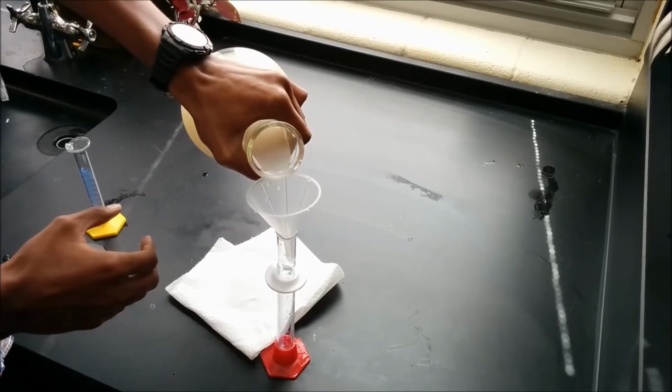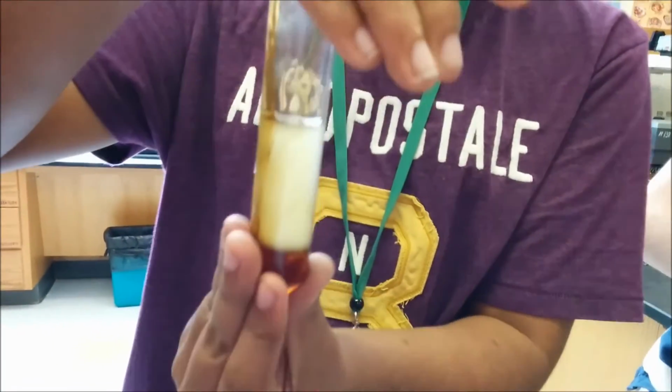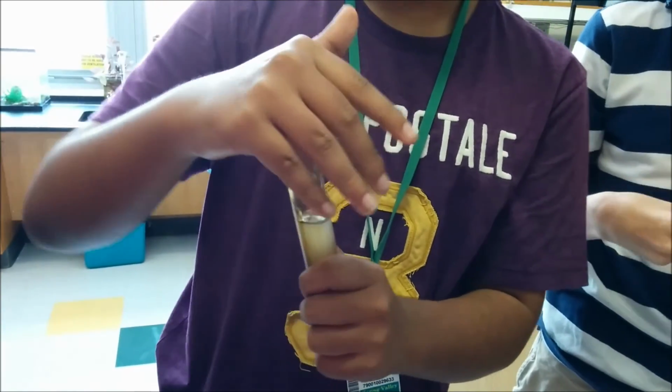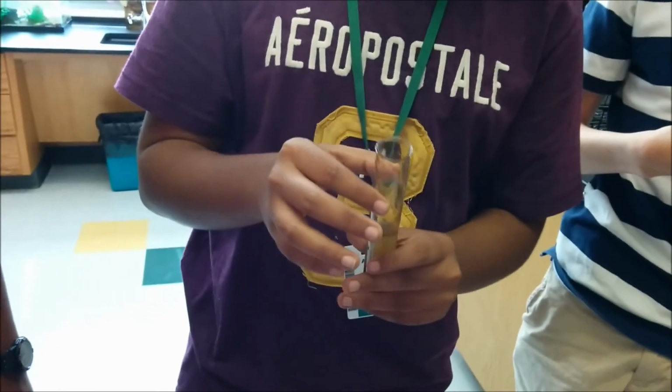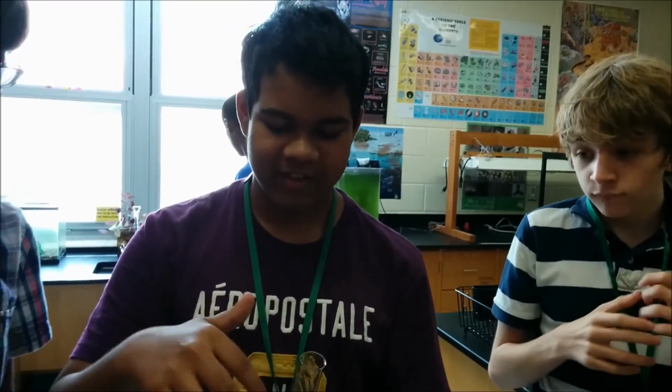We're going to add this to the test tube, and then we're going to add water. So what exactly are you doing right now? We're mixing our solution of water, yeast solution, and molasses. So how particularly are you mixing it? We're using 12.5 milliliters of water, 12.5 milliliters of molasses, and 5 milliliters of yeast. So are you shaking it around? No, we're just inverting it.